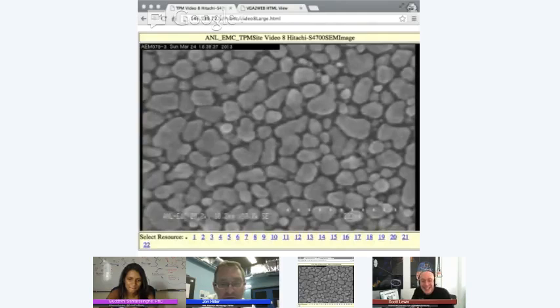That is crazy. So just the sound coming out of your mouth, on the air itself? Yes, I'm in a very well-controlled room. To give you an idea, the temperature does not fluctuate a tenth of a degree in this room. We have full vibration isolation in the foundation. We have acoustic panels. I don't know if you saw them behind. Yeah, I saw them in the background. To control the acoustics, and just by my talking, it's affecting the image here.